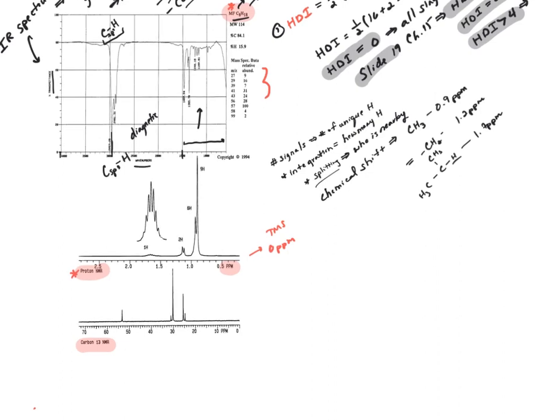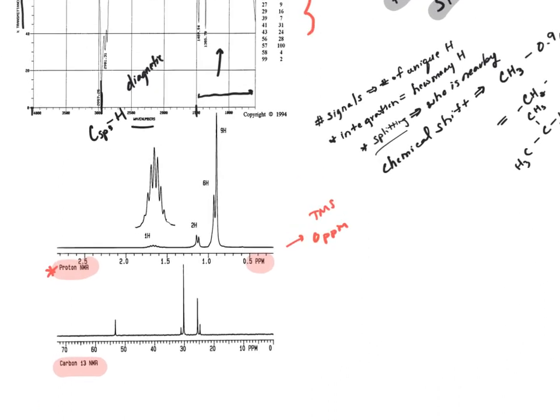All right, so if you do watch the spin-spin coupling portion of the NMR lecture, you know that I go over a couple of very characteristic splitting patterns that are very indicative of certain structural features in a compound, okay? One of those, which is really indicative, is a singlet, right?